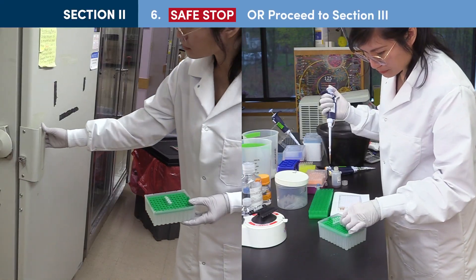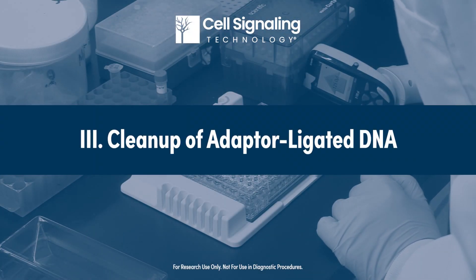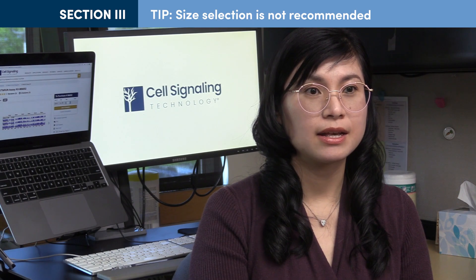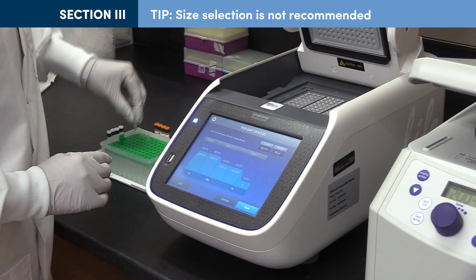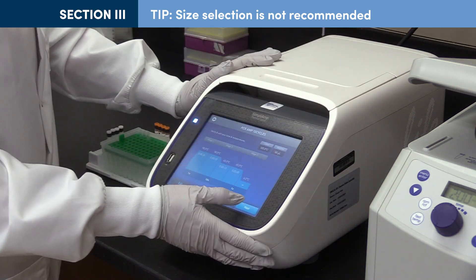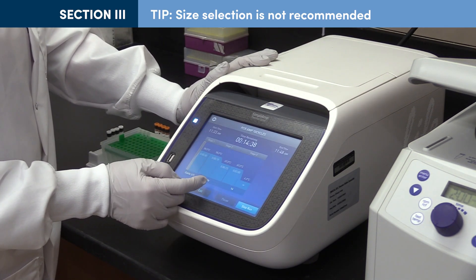Samples may be stored at minus 20°C or you may proceed directly to the next step, cleanup. During cleanup of adapter-ligated Cut and Run DNA, size selection is not recommended because it reduces both yield and diversity of DNA libraries. The shortened extension time during step 3 of section 4, PCR enrichment of adapter-ligated Cut and Run DNA, is used to exclude large DNA fragments that are incompatible with NGS.